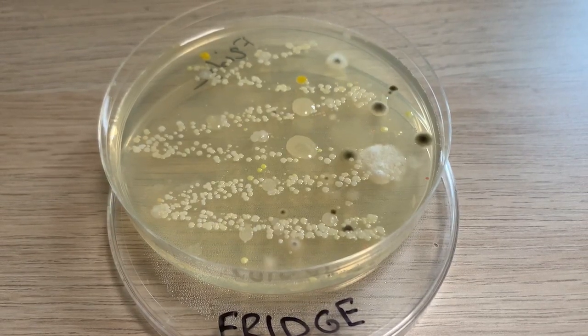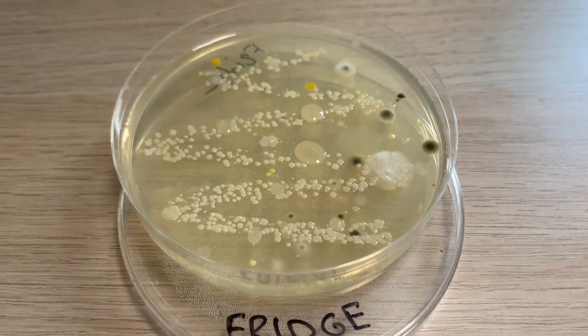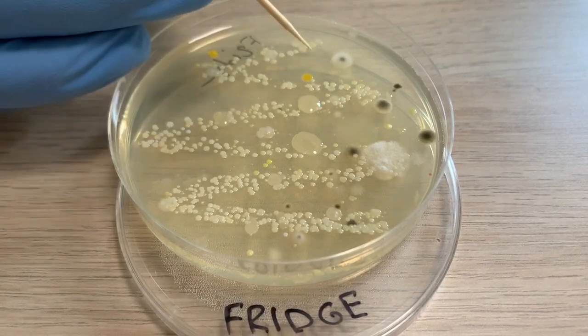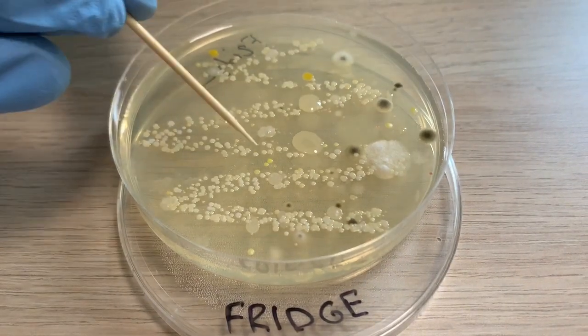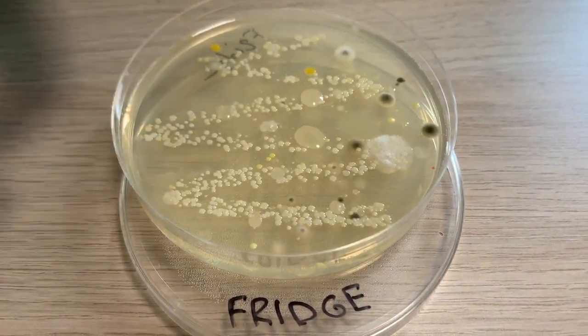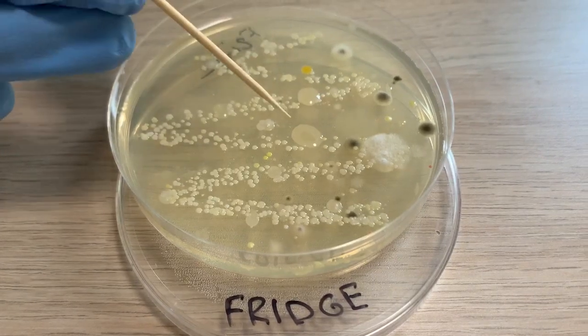The next sample is from the fridge. Here we can see different bacterial species, which are similar to the hands and phone samples. For example, Staphylococcus and Micrococcus colonies. However, we can also see new ones, like Panthea — the white small colonies — and Bacillus species.